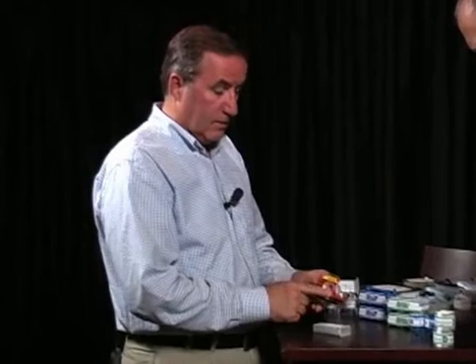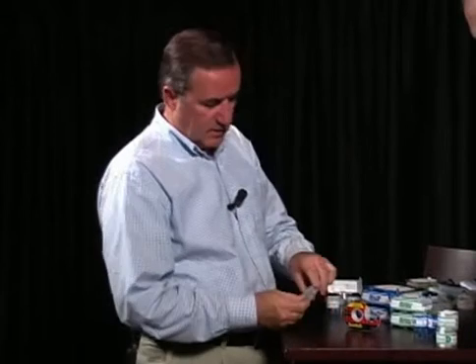To take a tape lift sample, you want a clear adhesive tape, single-sided, not frosted ever. It makes it very difficult for the lab to look through a frosted glass. And a clean glass microscope slide. They come in these nice mailers that are very sturdy.